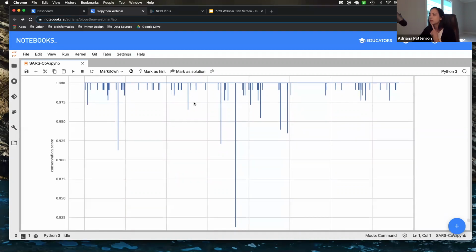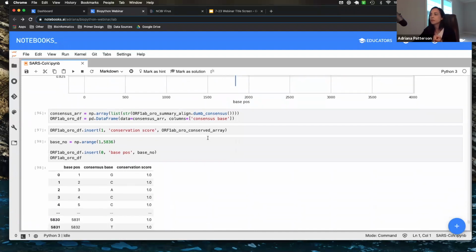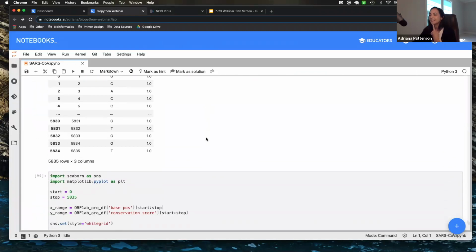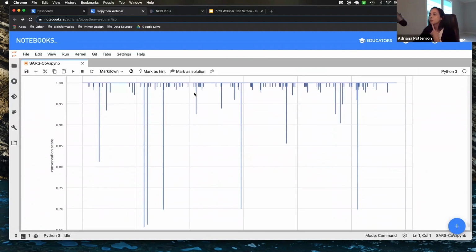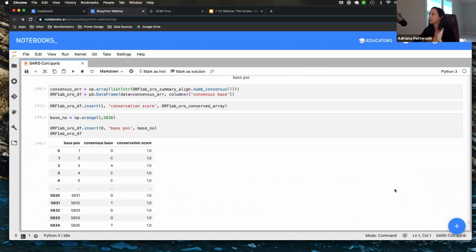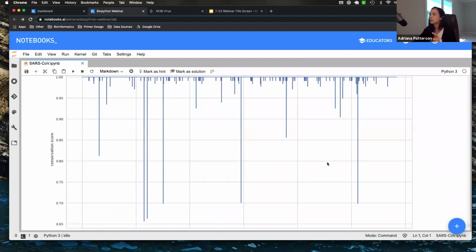So I thought we'd go ahead and do the same thing and look at the more mutated gene, or the NSP3 gene. I'm sorry, less mutated gene. I did the same exact thing using Seaborn and Matplotlib. And although it looks like there are more mutations across the board, there are, because this is a larger gene. Remember, this one was around 6,000 bases, whereas the S gene was only about half that size. So just eyeballing it, it looks like there are more mutations.